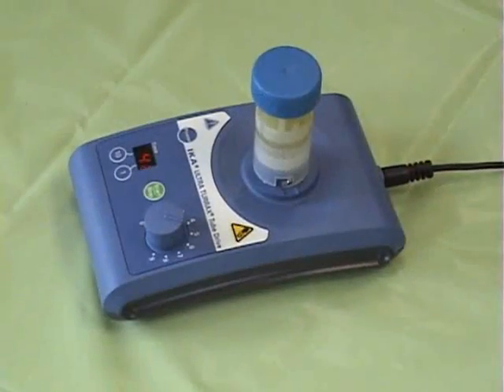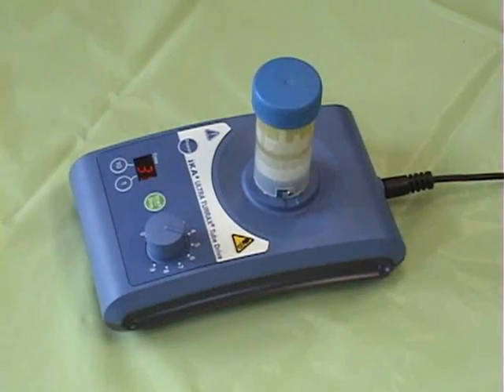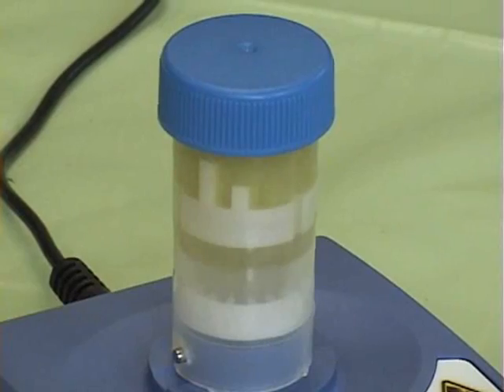Low profile design and compact footprint allows the IKA Ultra-Turrax homogenizer to be used in even the most cramped laboratory conditions.